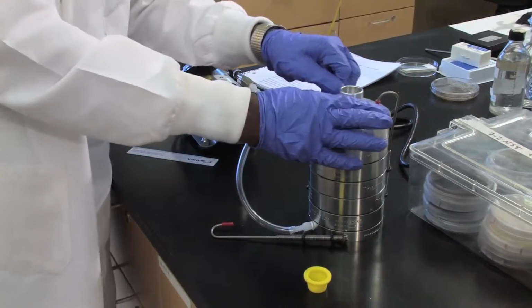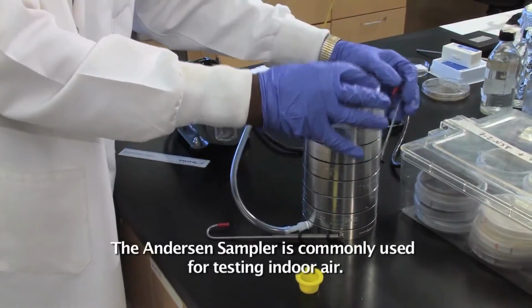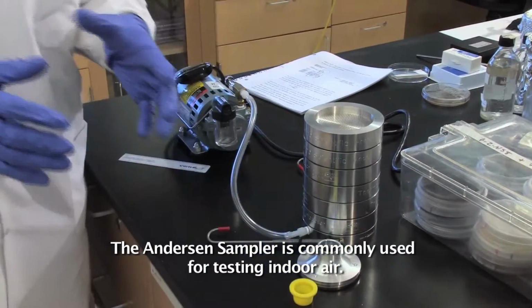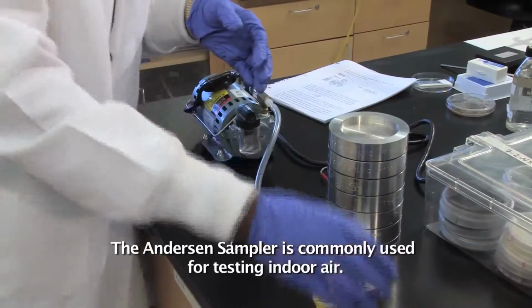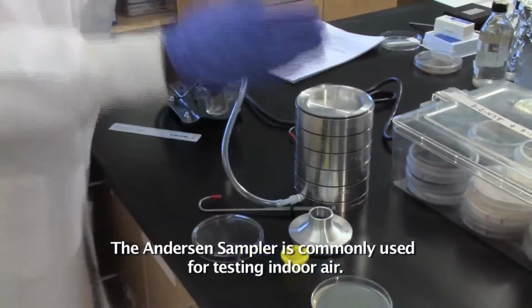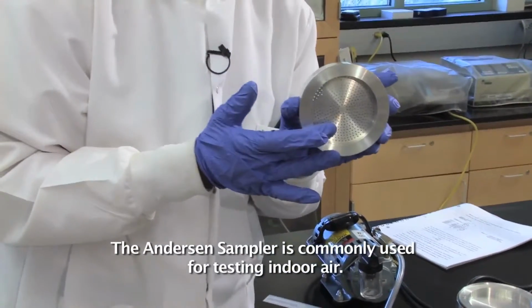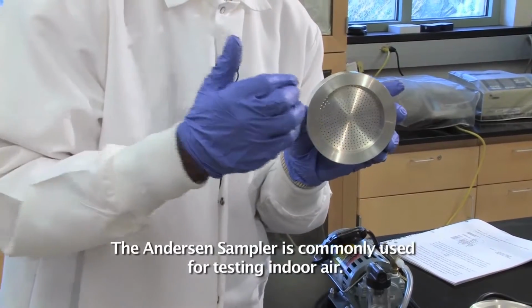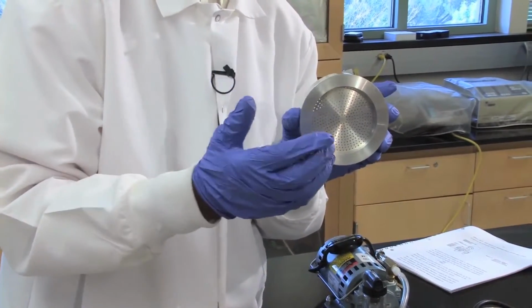Now, as we draw the air in, we have to wonder how are we to know what are the organisms in the air. So what we do, underneath each one of these perforated rings, this is the top portion. So this is letting in any particulate 7 micron and above.